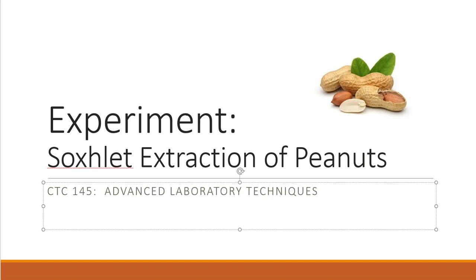In this lab, we are going to talk about peanuts. See, what other class can you take where you learn all of the things that are necessary to get you through life each and every day? And peanuts are one of those, right? So we're going to talk about peanuts, but more importantly, we're going to talk about an advanced laboratory technique called the Soxhlet extraction and the Soxhlet extractor.